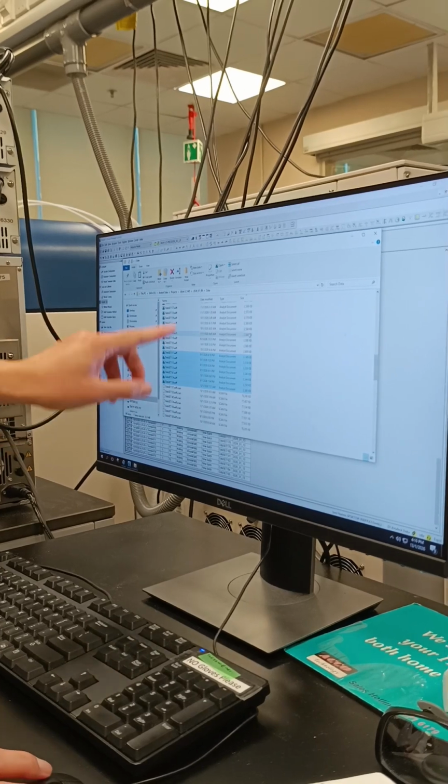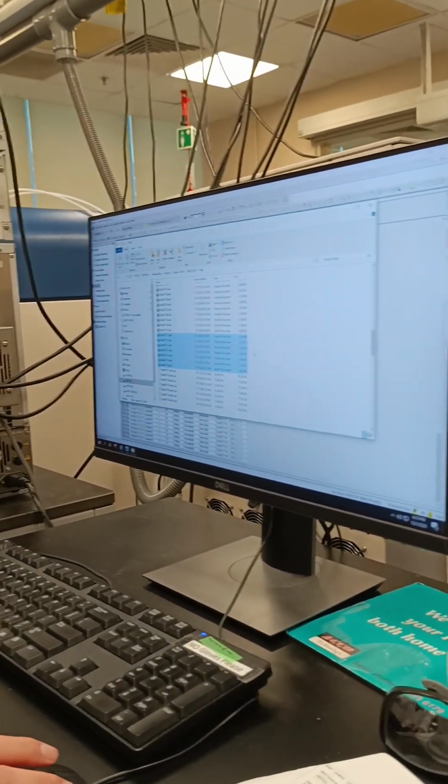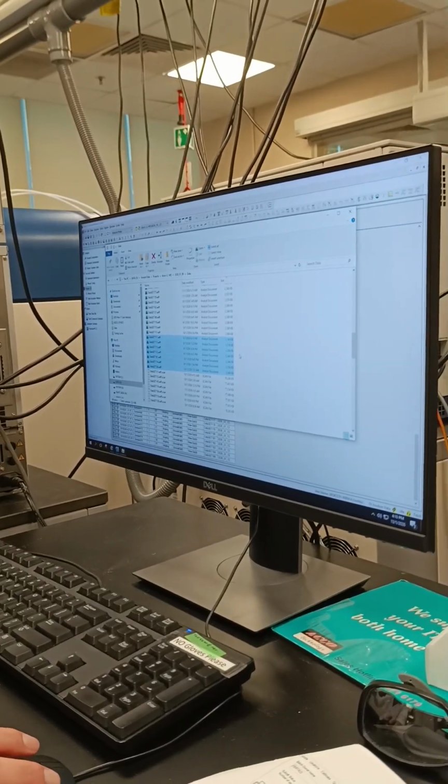If any sample occurs with 3,000 something, then I know it's maybe not extracted properly, or, unlikely to be the machine because all the others seem okay, right? So that's one way to check it. But if everything is 3,000 something, it's a machine problem. It's very obvious.